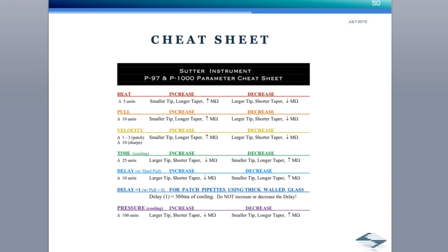I found that after I pulled a few pipettes, the total pulling time is becoming shorter and shorter, and the pipette tips may be becoming longer, but after I give the puller a break, the total pulling time returns to normal. Is this normal, or do I need to change the filament?